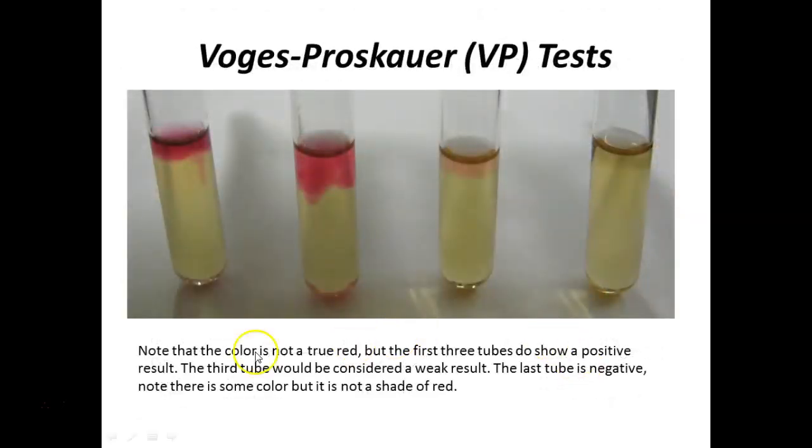So there's a better picture of the tubes. These are definitely positive, right? This one's just weakly positive. That one, no reaction, negative.